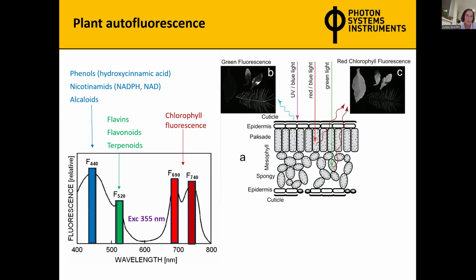All leaves here are senescing, or maybe infected, I guess. Very typically, here you can see a very typical image. On the right side, you can see the leaf in chlorophyll fluorescence, where you cannot see a part of the leaf. There is some lesion or something like that. And in the green or blue, you can see the high fluorescence in the blue-green region.